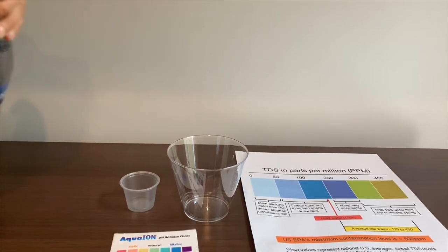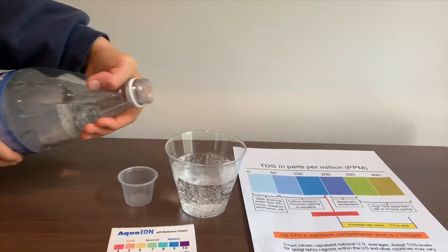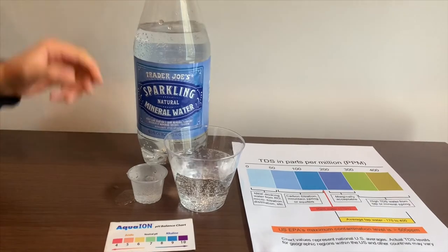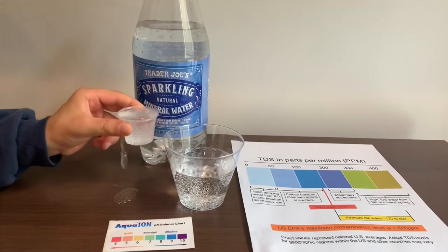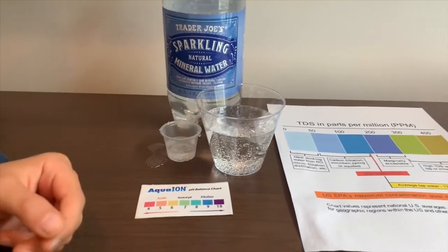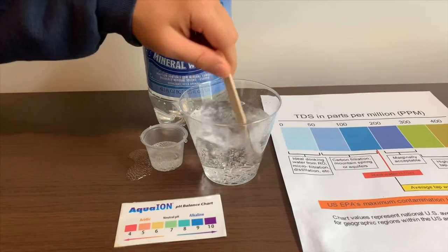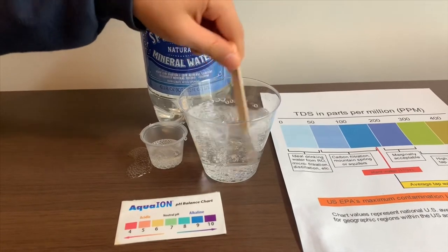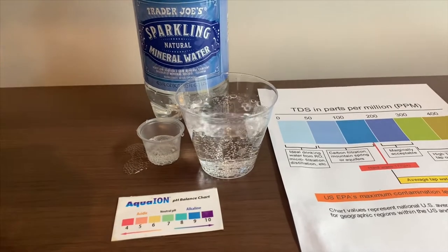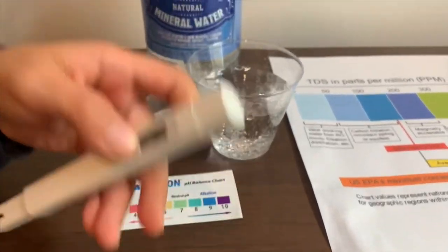Let's pour some water in. This is a little too much for the pH cup, so let's pour some back into the TDS tester. Let's test the TDS level first, but let's start with a little for a better result. Turn on the TDS tester, make sure it says zero, and put it in.